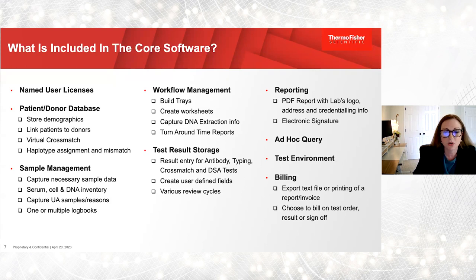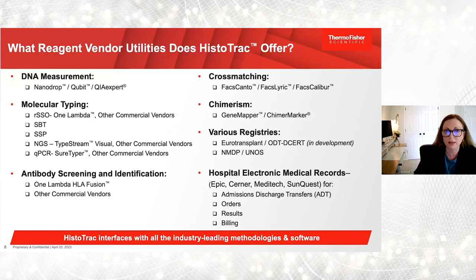You're able to build internal workflows. So you build trays and worksheets, capture DNA extractions, do turnaround times. You can do reporting and ad hoc query. I'll show you this in just a little bit. So this is just querying back our data. You have results for all of your testing needs, billing, and then a test environment so that if you needed to bring on a new methodology, you're not doing that in your production database. Or if you have a new technologist, you would want them to train in the test environment, not your prod.